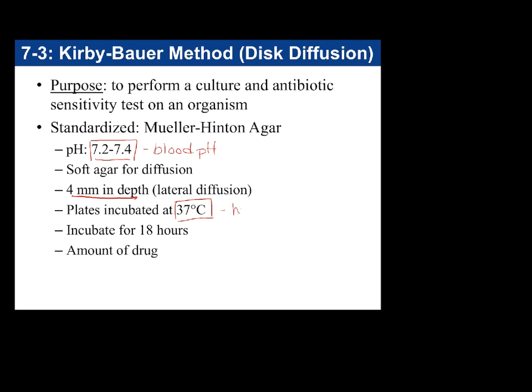Again, if we're testing antibiotics, we want to be able to test them at the temperature in which antibiotics are going to be used, in which organisms are going to be growing. We incubate these plates for 18 hours, so it's less than our usual 48.